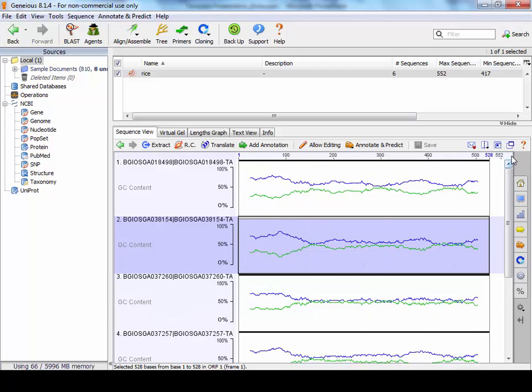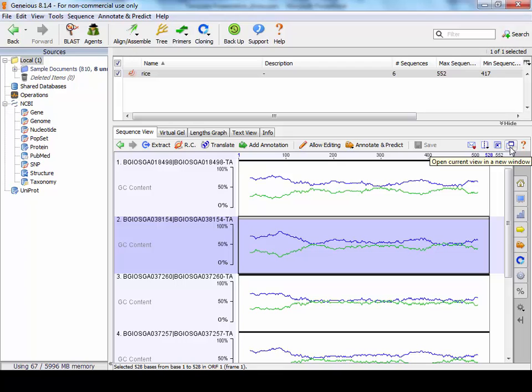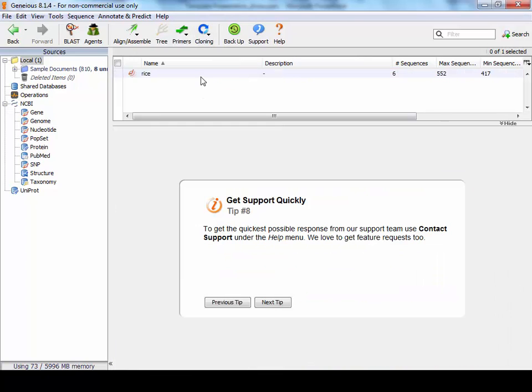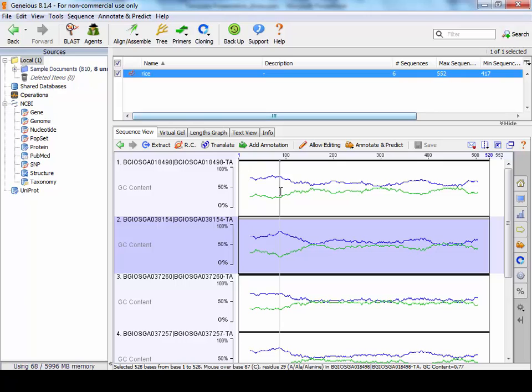This is also a useful button because you can only look at one file in this pane at any one time. So if you use this button here to pop out this pane, then you can look at two different files at once and you don't have to wait if it's a particularly big file for it to load because you have them both loaded already. This is much more efficient than going from one file to another, one file to another, and waiting for it to load, especially if they're big.